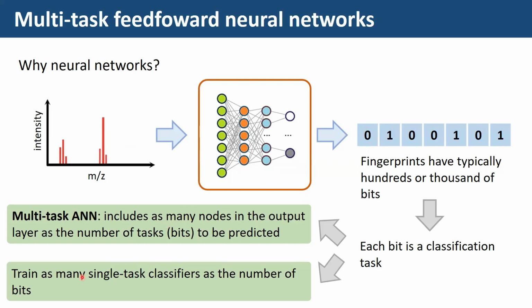So what you can do is to train a number of classifiers which is equal to the number of bits, in this case 166.